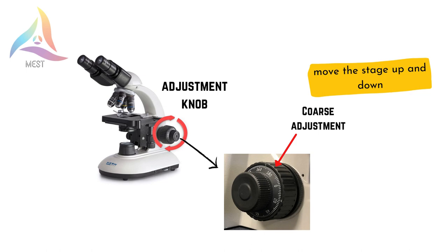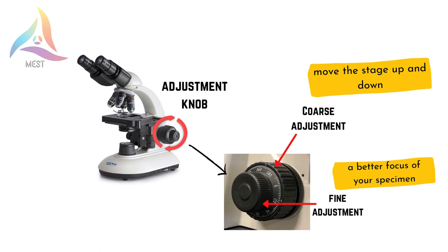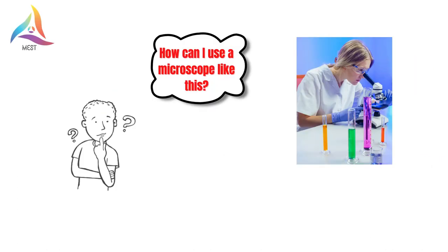The coarse adjustment knob is used for initial focusing and only with the low power objective. The fine adjustment knob is a slow but precise control, used to get a better focus on the image when viewing at higher magnifications.